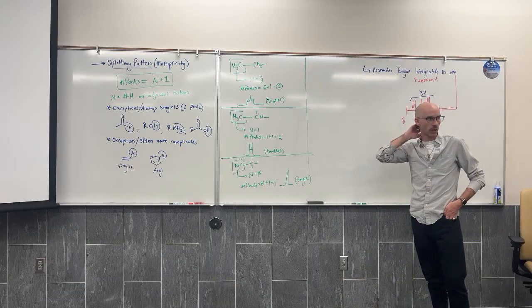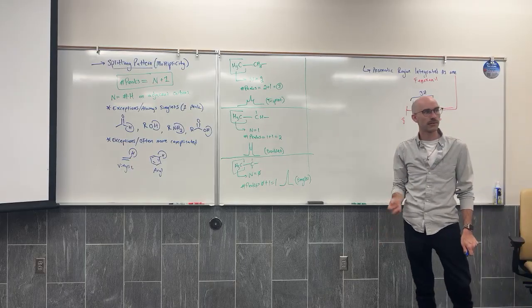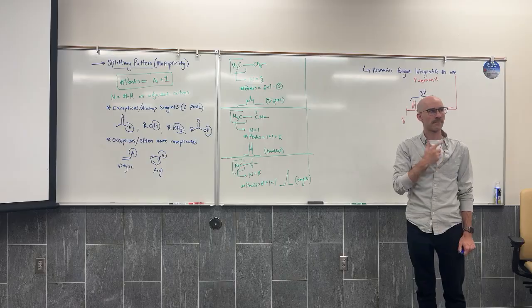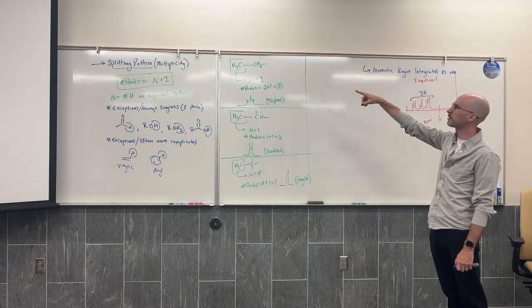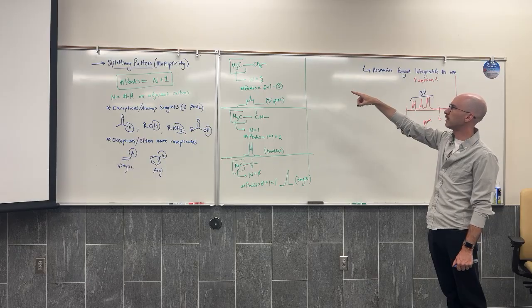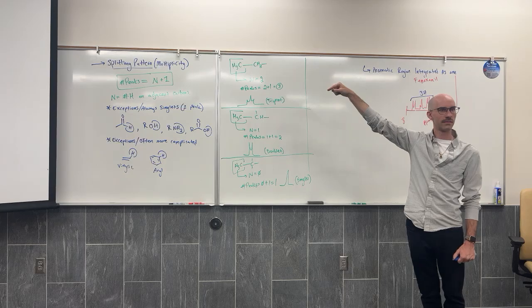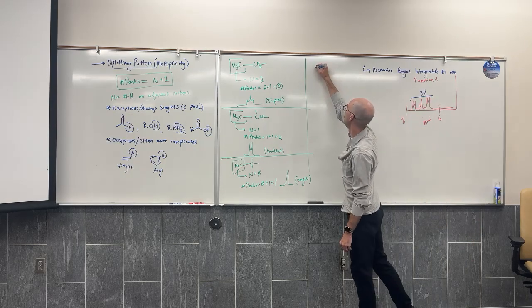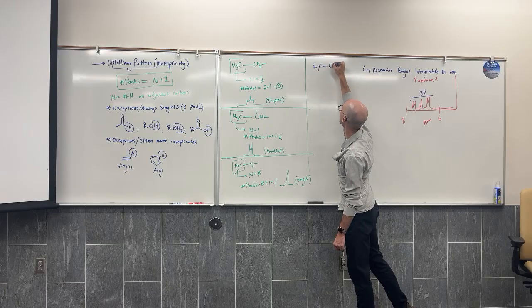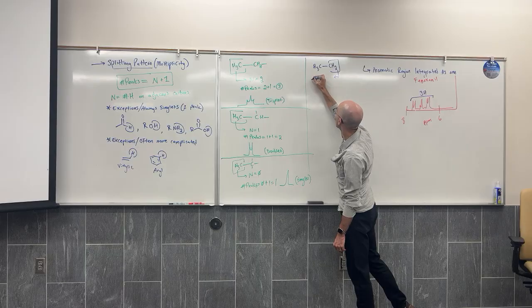So is the biggest I can go 3 peaks? I can only have a maximum of 2 neighbors? Well, the 2 neighbors of the CH3 themselves have 3 neighbors. So 3 neighbors would give how many peaks? Right. 3 plus 1 equals 4.